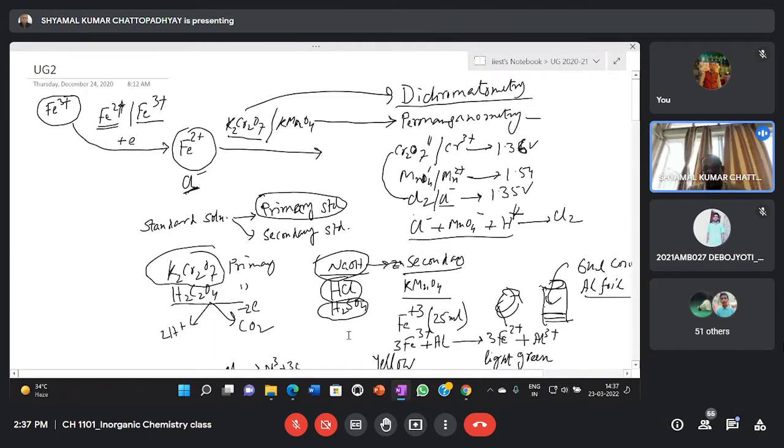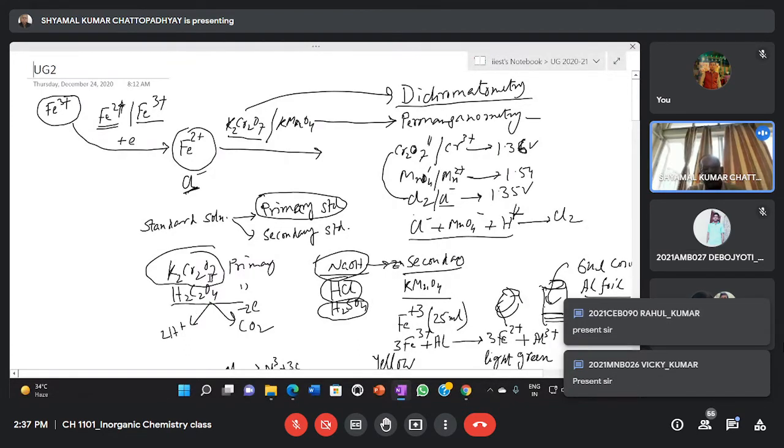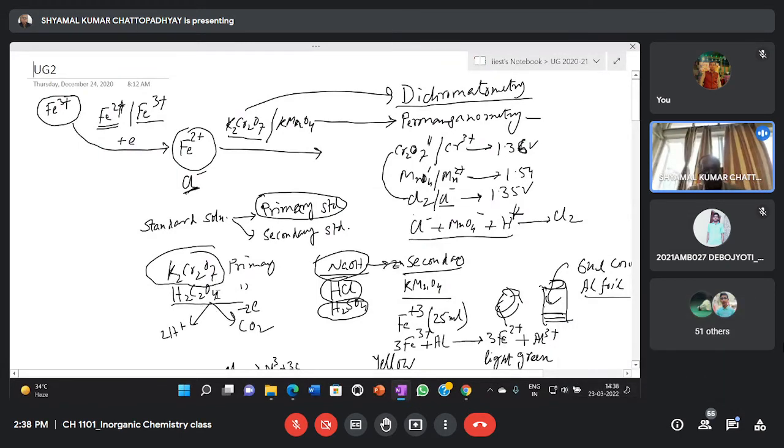So sodium hydroxide, HCl, H2SO4, etc., all of them are secondary standards. If you want to prepare a standard solution of sodium hydroxide or HCl or H2SO4, what do you have to do? You have to prepare a standard oxalic acid solution. Oxalic acid is a standard for both redox titrations like potassium permanganate standardization as well as acid-base titration. Oxalic acid is both an acid as well as a reducing agent. So you can prepare a standard oxalic acid solution and use it to standardize an oxidizing agent like permanganate. You can also use it to standardize a base like sodium hydroxide.